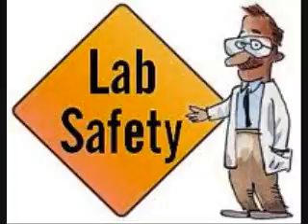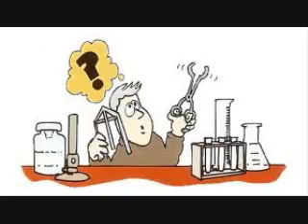There are some general guidelines that should be followed and taught to students before using the science lab. Students must have a responsible manner at all times in the science lab. Students should follow all written and verbal instructions that the teacher gives. If an instruction is not understood, the student must know to ask the teacher before doing any activity. Students should not ever touch any equipment, chemicals, or any other materials in the science lab until they are given instructions on what or how to do so.